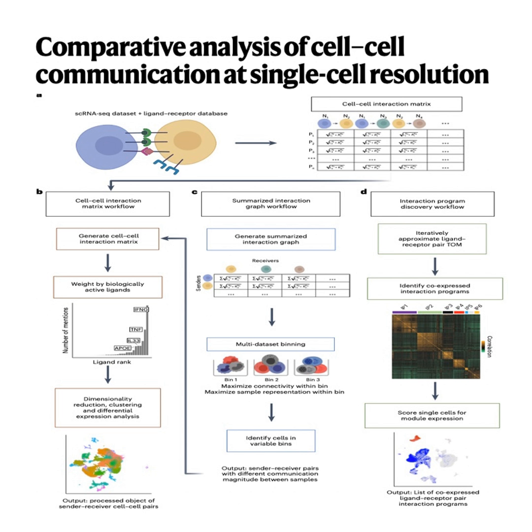How does it do that alignment? It looks for mutual nearest neighbors, MNNs, across the datasets. Think of them as like transcriptional soulmate cells in sample A that are extremely similar to specific cells in sample B. These MNNs act as anchors. Okay, anchors between the data sets. Right. Then it assigns every cell to a bin identity. The goal is to create bins where the cells within a bin are as similar as possible, and importantly, each bin has cells represented from all the samples you're comparing. It minimizes aggregation while maximizing comparability across conditions.